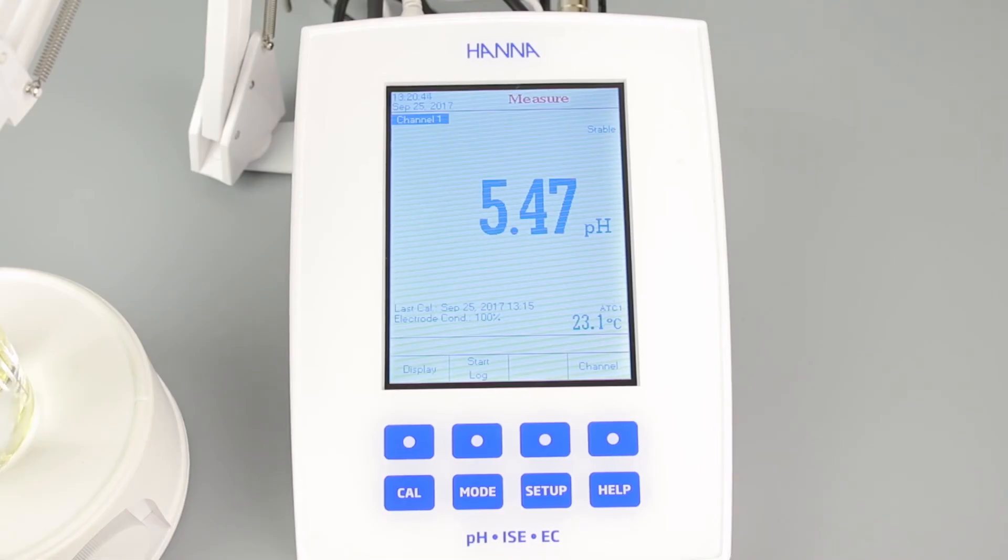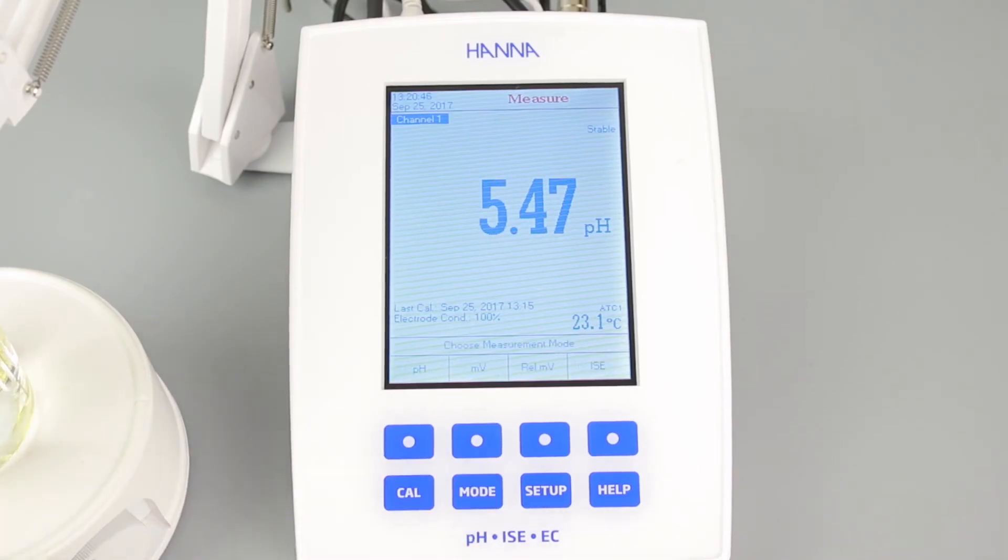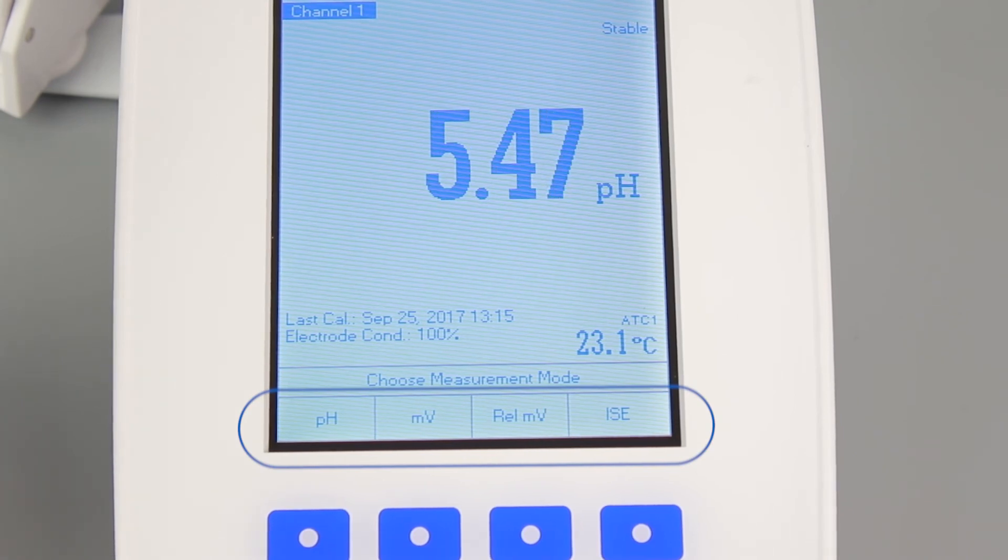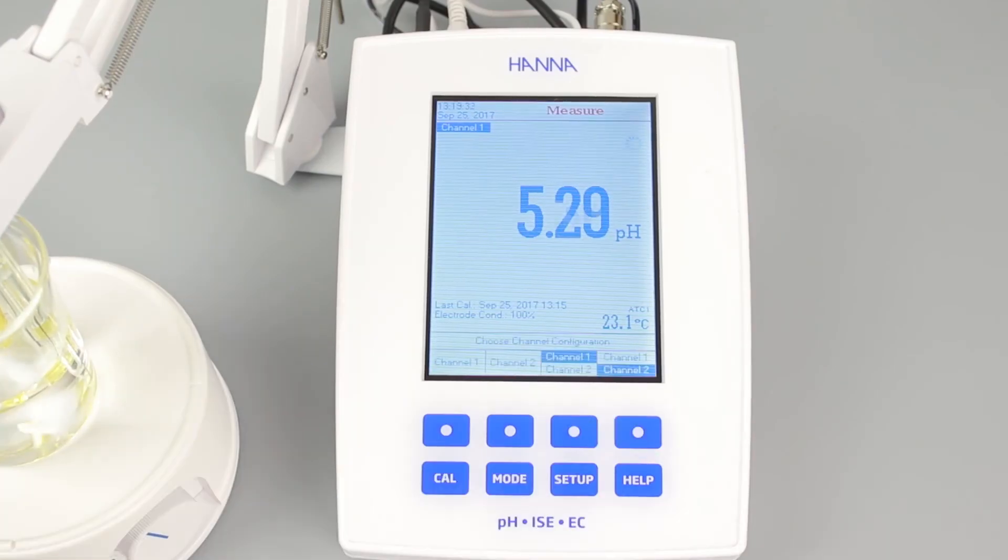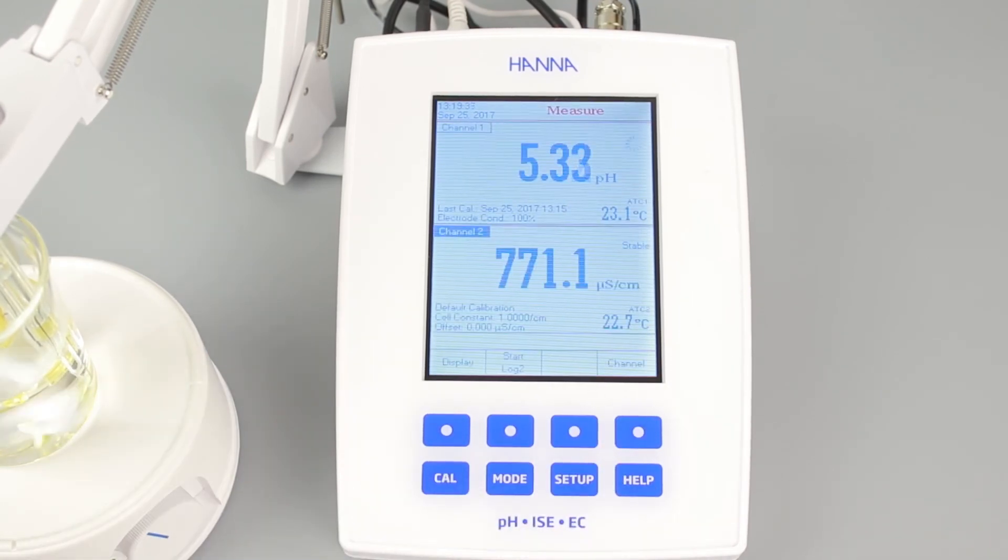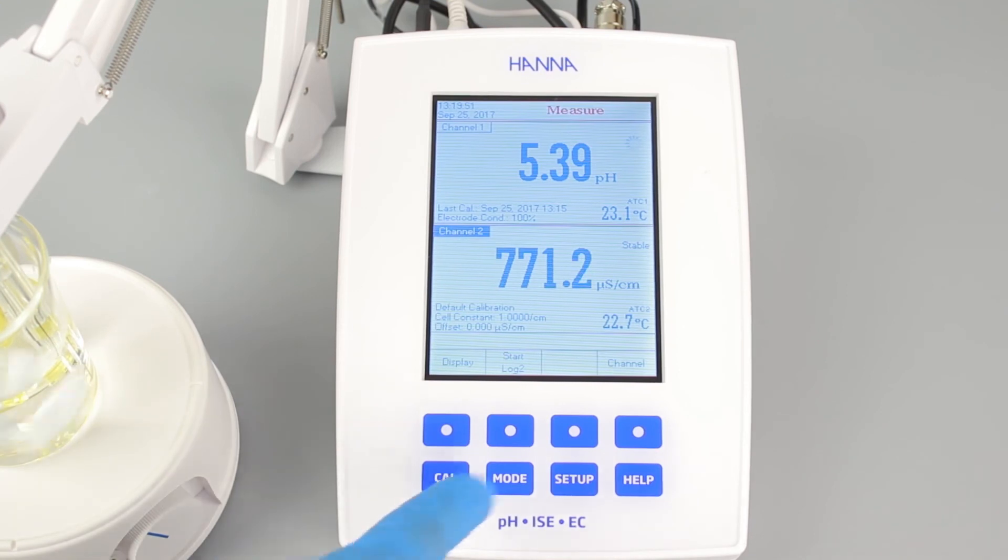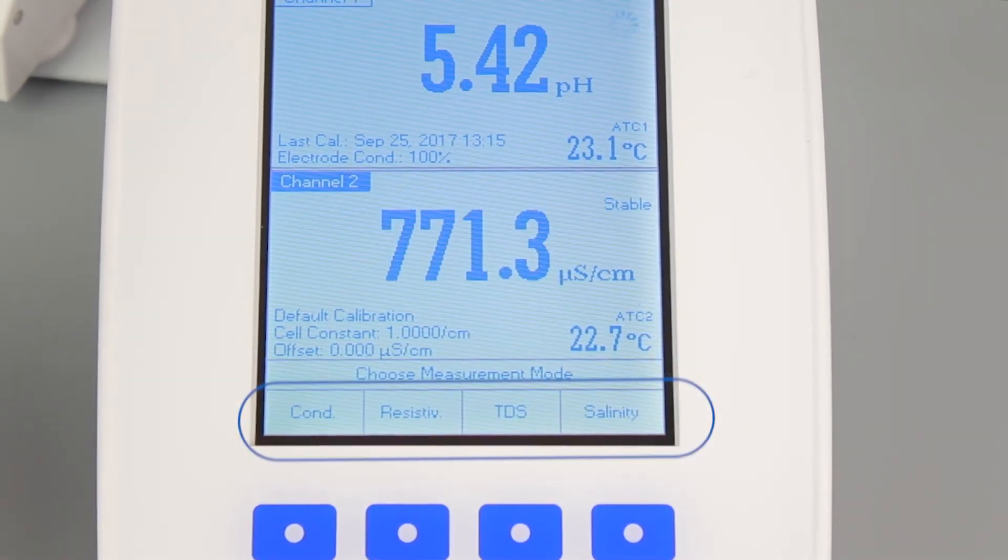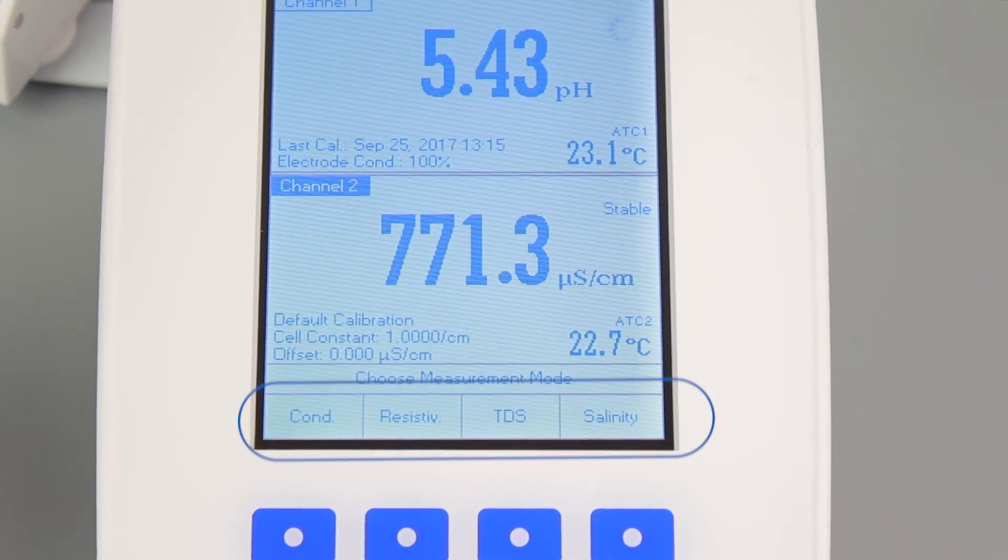After calibration, you can begin taking measurements. Place the electrodes into your sample and wait for a stable reading. Once stable, you can press MODE to switch between pH, millivolt, relative millivolt, and ISE. Pressing channel and then one of the dual level display buttons will let you see both readings at once. When viewing EC in two-channel mode, press MODE again to switch between conductivity, resistivity, TDS, and salinity.